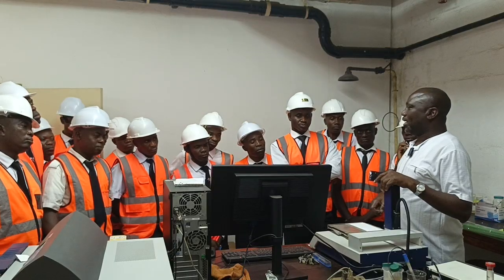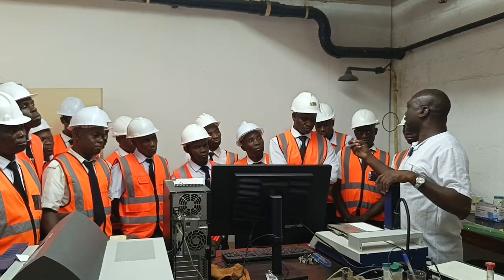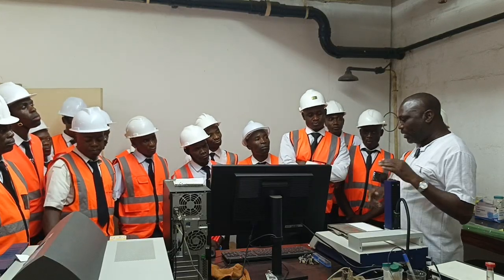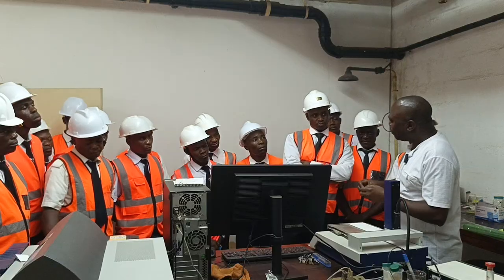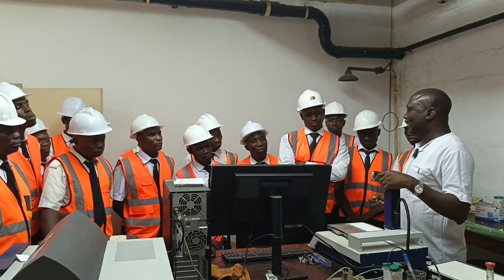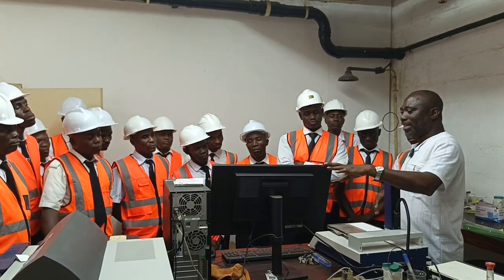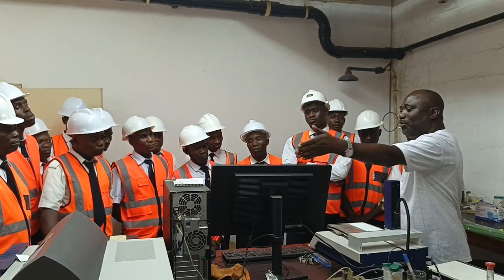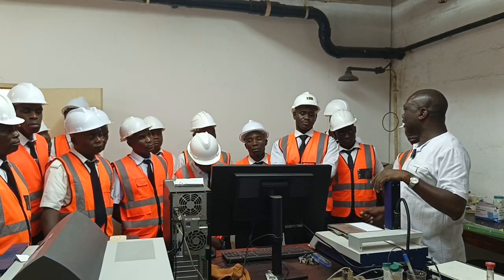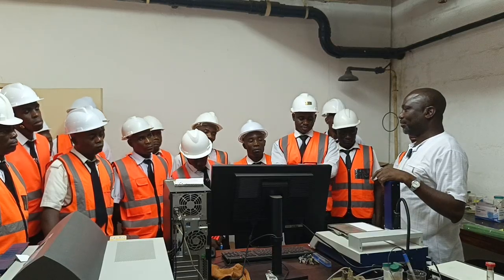And if you even have a control, the control is something that you know, like a TNT you have in the lab. You can put, next to your sample, a control TNT, so you should also compare with this. So the software compares. You have to feed in the information, and it will be reading according to the information you feed it. So this is the HPTLC also.